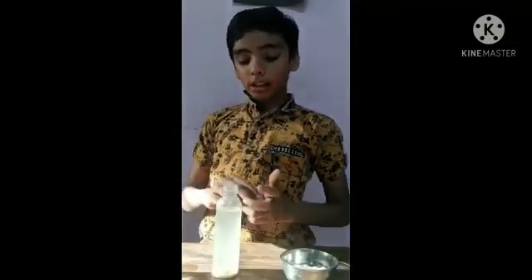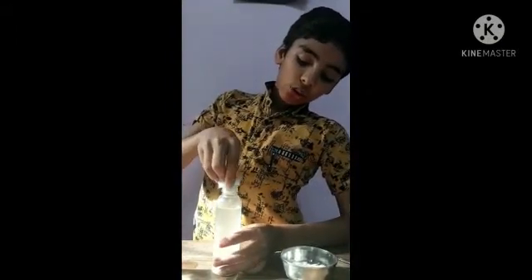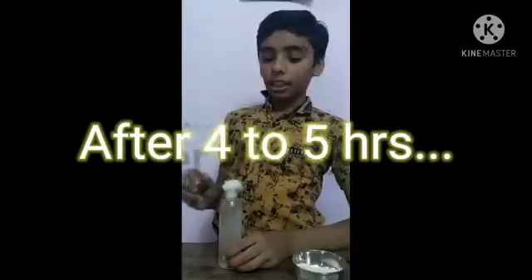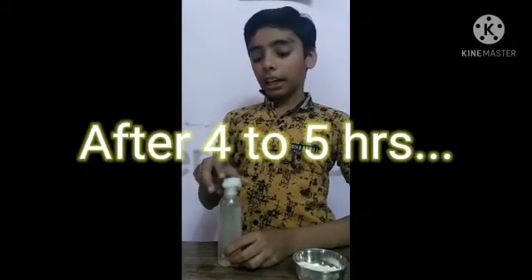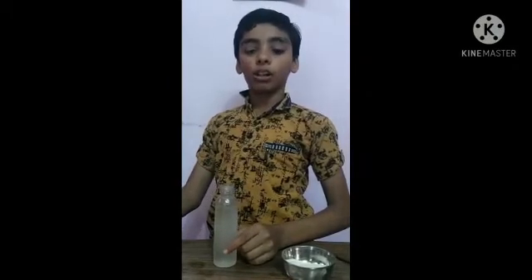So when you now smell it, it will not have any change. Then you have to take this cotton and shut its mouth and let it be for 4 to 5 hours. So now 5 hours are completed, and when you take out this cotton and smell it again, it smells like alcohol, and this is due to fermentation.